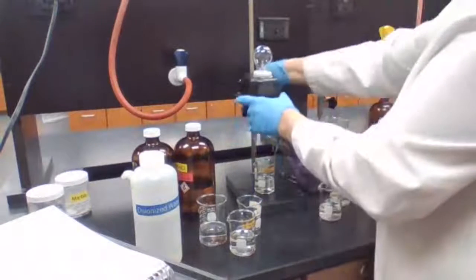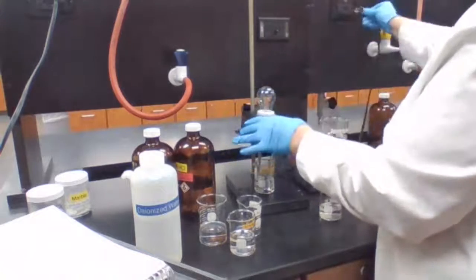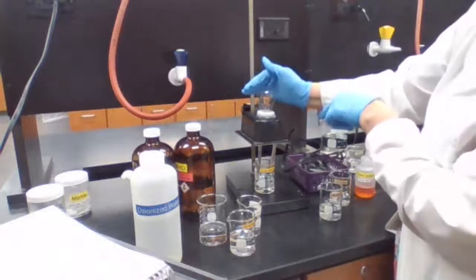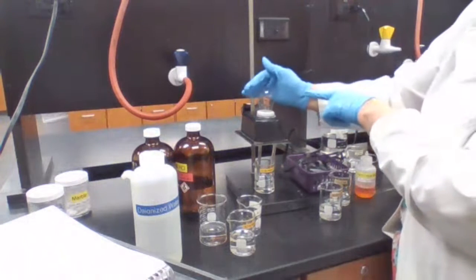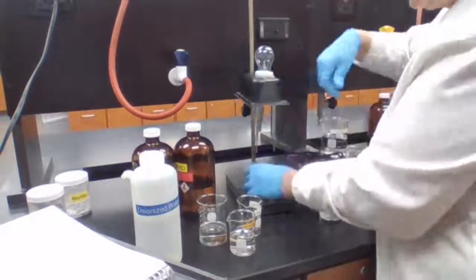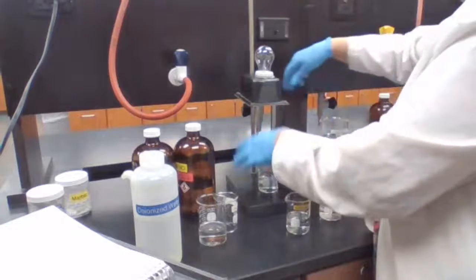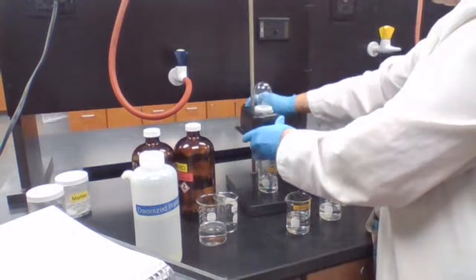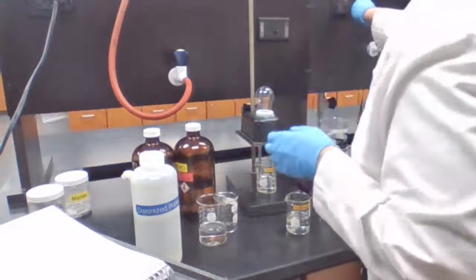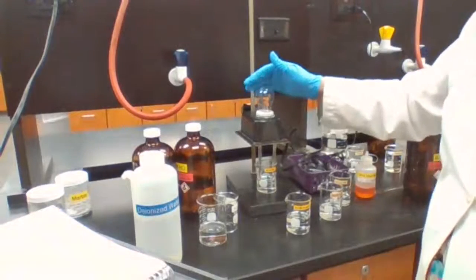Acetic acid, which is a weak acid, is giving me very dim light, so it is a very weak electrolyte. And then we have aqueous ammonia, which is ammonia and water. Very dim light, even if it's there, it's very hard for you to see.